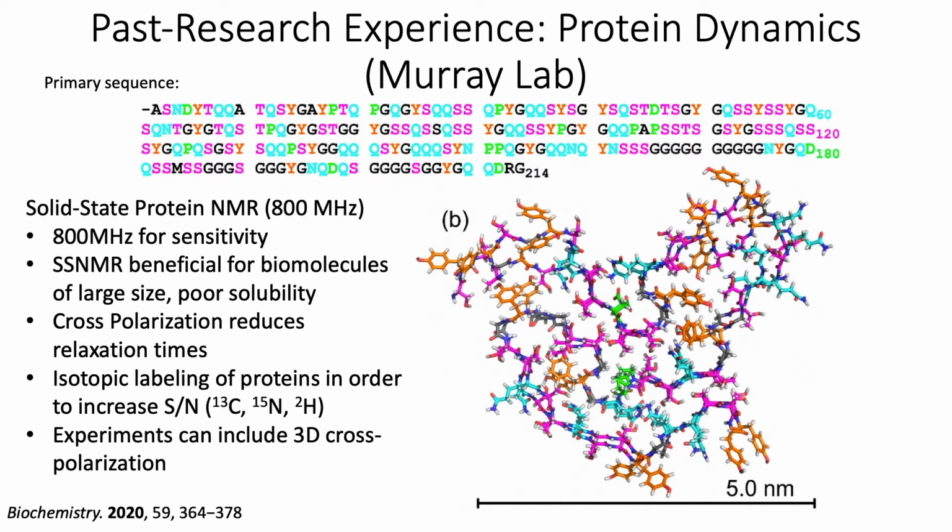And again, the experiments that they can use include 3D cross-polarization, which again goes beyond the scope of this class, but this just goes to show that when you start studying such complicated molecules, you need a high-level instrument in order to enable proper resolution and assign the structure.